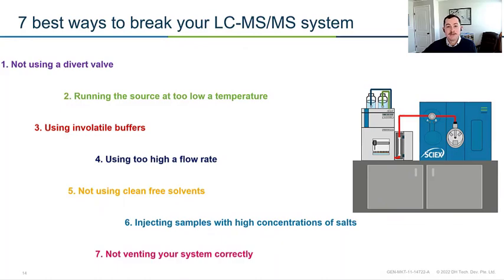So they just went ahead, took that bottle, put it on the LCMS, and submitted the run for over the weekend. Unfortunately, that mobile phase had a ton of mass spec incompatible buffers in it. And it also had a really high concentration of salts. And when we got back in the morning, Monday morning, after a long weekend of running, there was quite a big buildup of salt on the mass spec, and there was a lot of corrosion already occurring. We ended up having to replace a ton of the front end to get the system operational again.